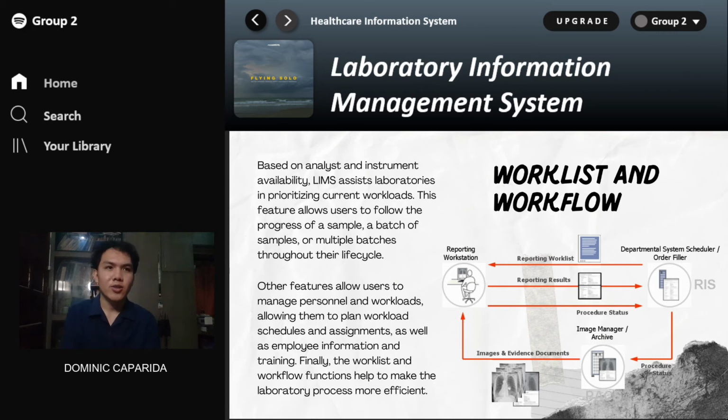And this order filler can also provide the procedure status to the image manager or archive. This image manager may present images and evidence documents on the patients, which can lead to the reporting workstation again for analysis, for the credibility of test results and reliability of the tests.